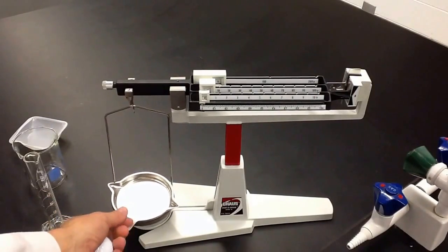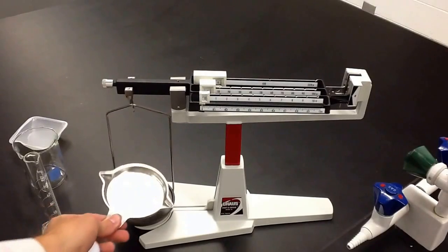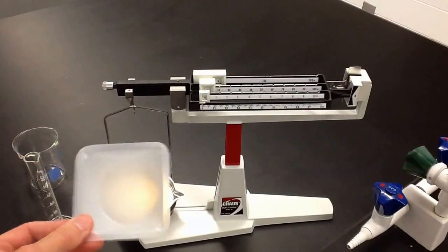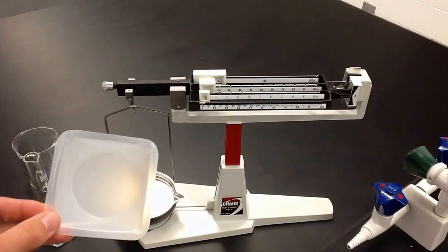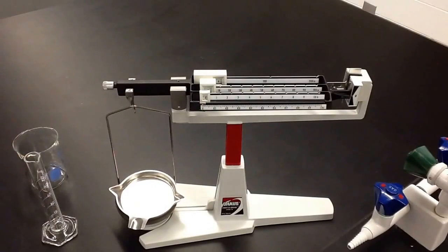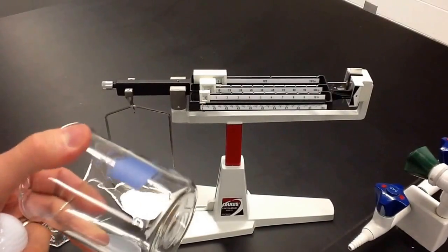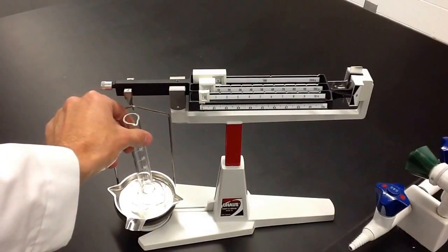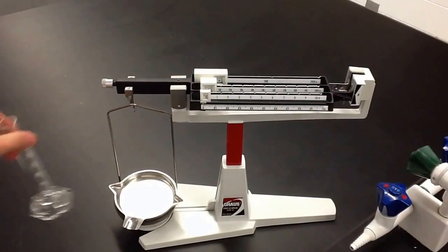The only things that can go on this pan — you can never put chemicals on this pan or anything else except for a weighing dish like this, or a tare. You'll have to find the mass of this so that you can subtract it from whatever you're trying to find the mass of, or you can put a beaker on there. But never put a graduated cylinder on there because they're a little too tall and can tip over very easily.